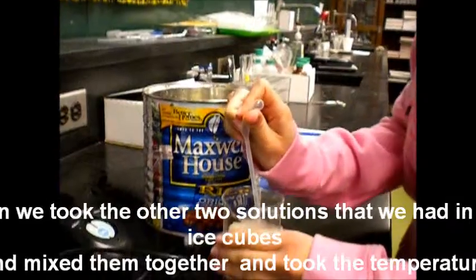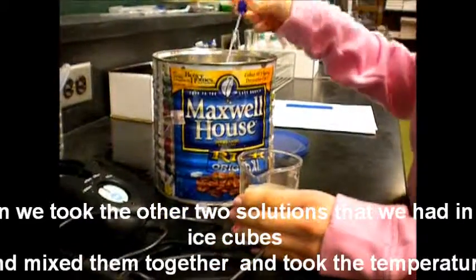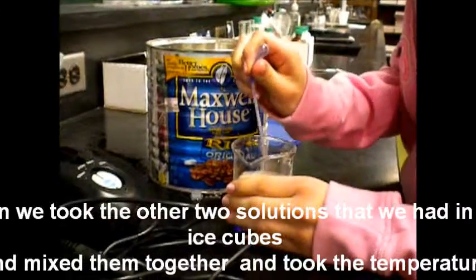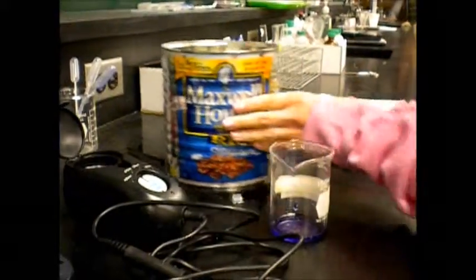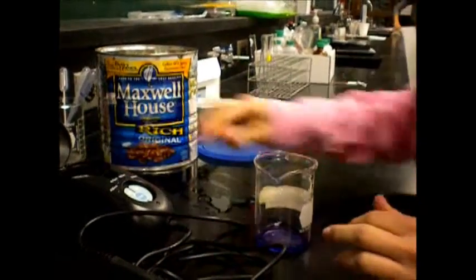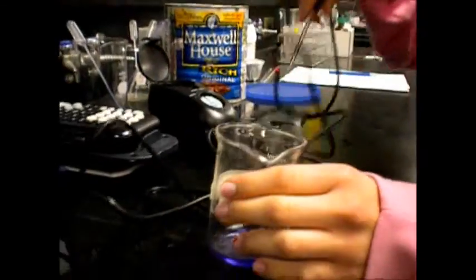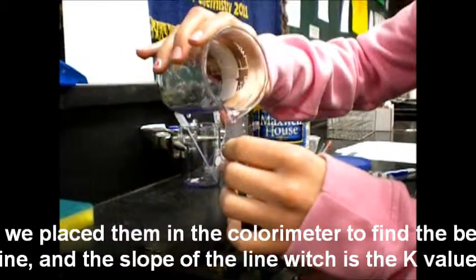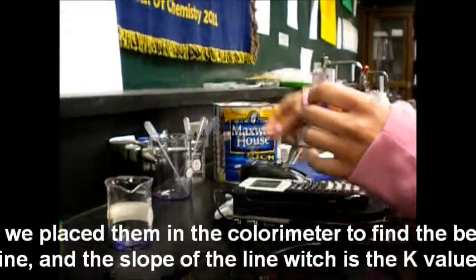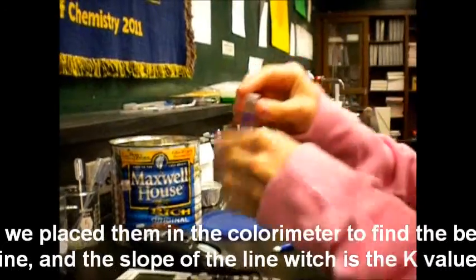Then we took the other 2 solutions that we had in the ice cubes and mixed them together and took the temperature. Then we placed it in the colorimeter to find the best fit line and the slope of the line, which is the K value.